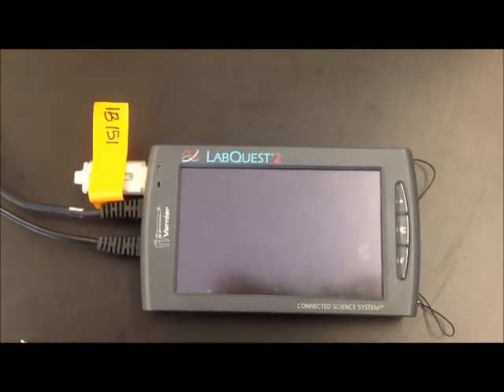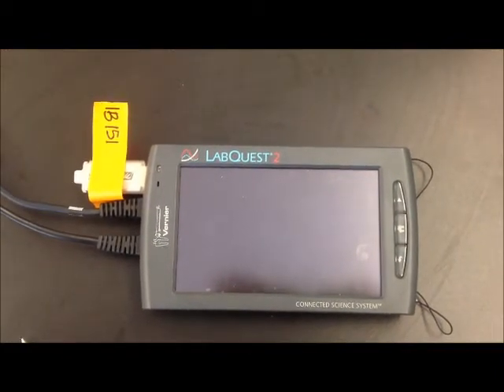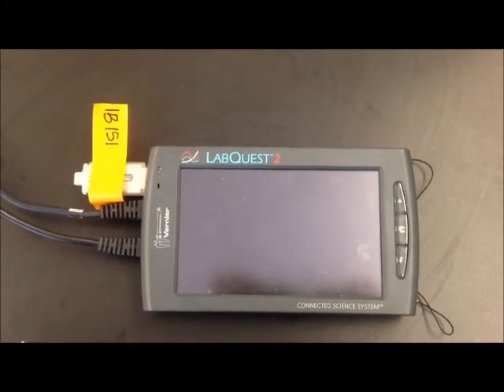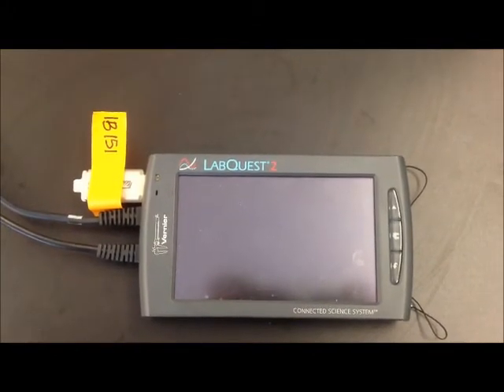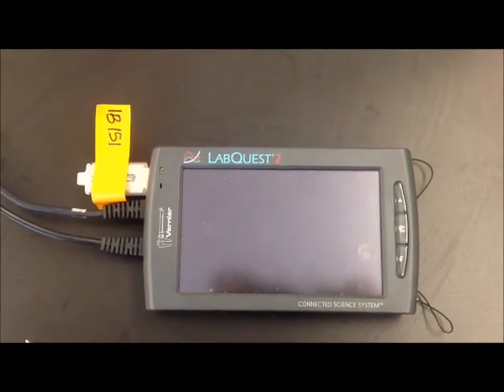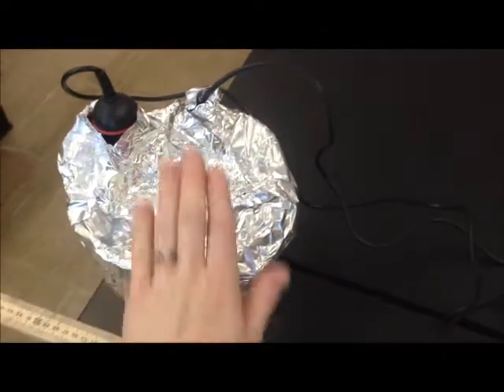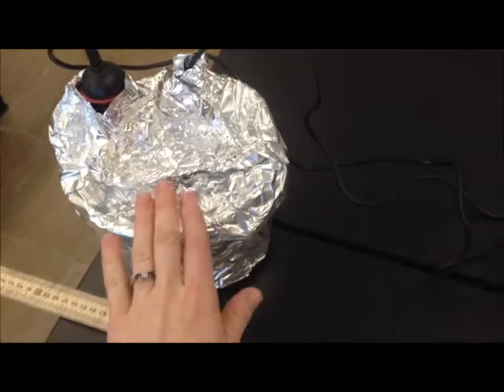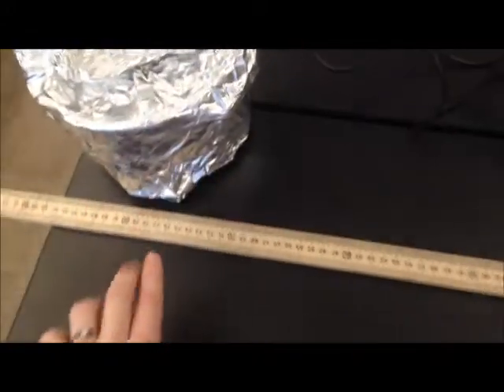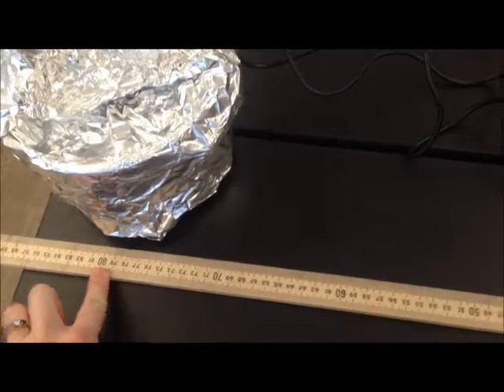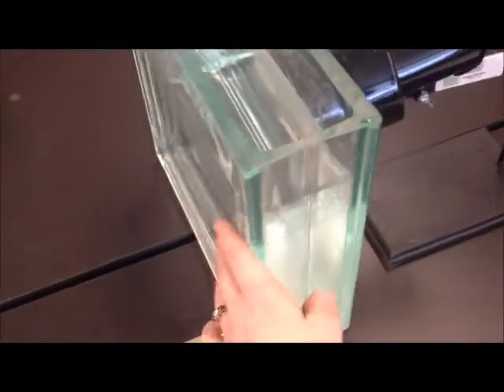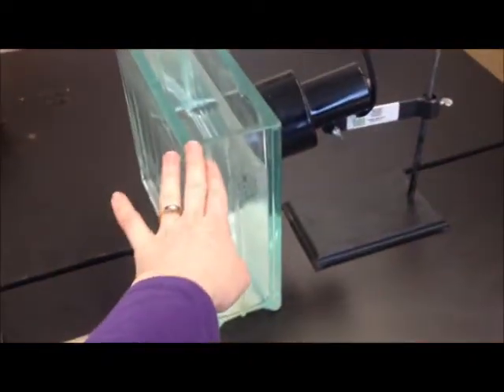Welcome to IB151. This video will help you learn how to use the LabQuest 2 device and the LoggerPro software. Right now we have it set up so that the CO2 and O2 wires are connected to our device. Our pea plant is inside this bucket and it's covered in tin foil to simulate darkness or nighttime. We have it 80 centimeters away from our light source and heat sink, and the light is off at the moment.